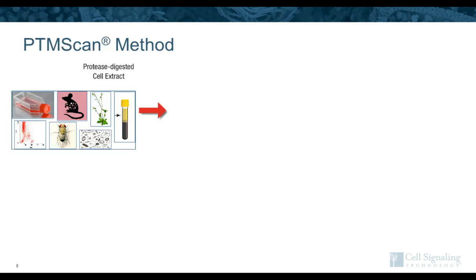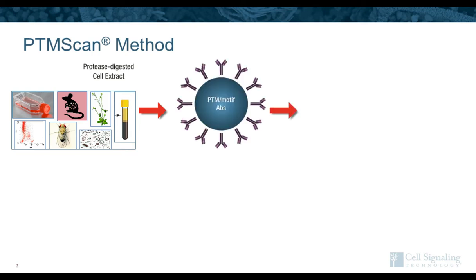So we use these specialized antibodies in the method, and one of the great things about PTMScan is it's very flexible as far as input material. So you can use cell lines, tissues, we've done plant material, microbial samples, whole organisms like Drosophila, sorted cells or subcellular fractions, even serum or plasma. And one of the first things we do is digest to peptides. So here we're doing peptide level enrichments, not enrichment of full-length proteins or protein complexes.